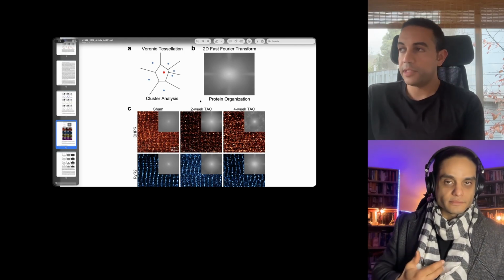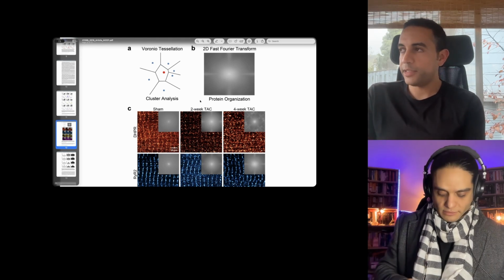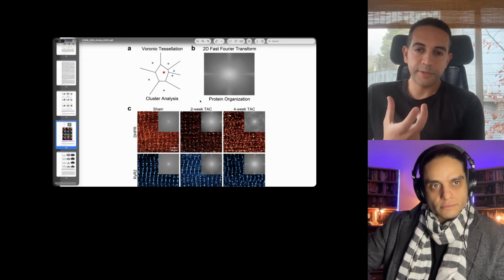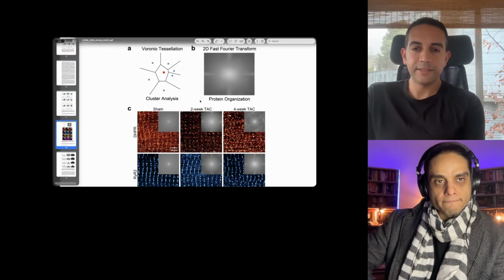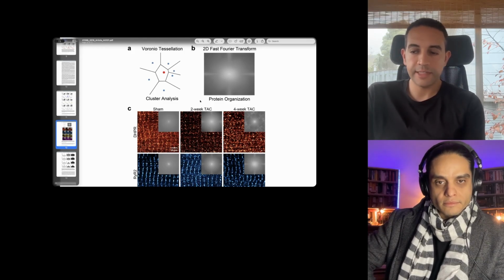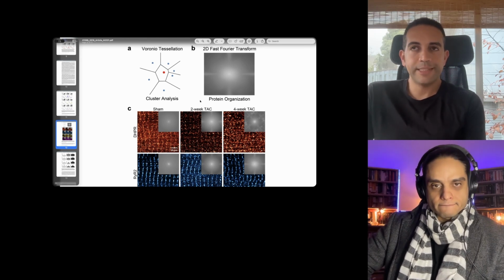But the point I was alluding to is that even with very good spectral separation, the intrinsic properties of the chromophore you're working with are going to yield a different number of photons, which yields a different localization precision, which yields a different resolution, which then impacts the cluster analysis and the other downstream analyses. But you're completely right: if you want to couple together conditions cleanly, it's at most 3-4 colors.